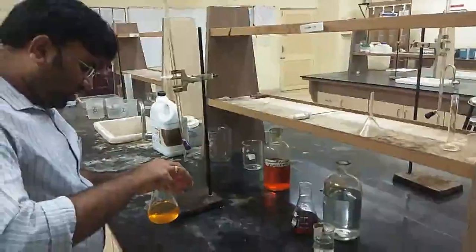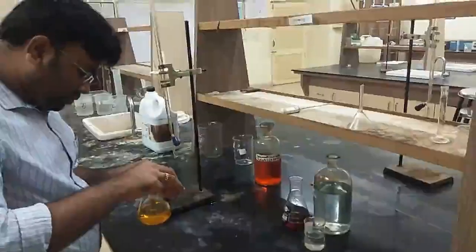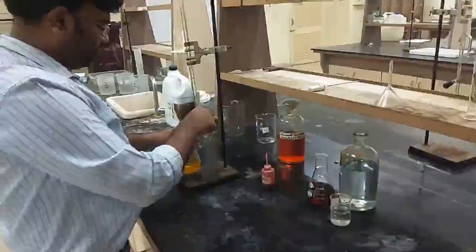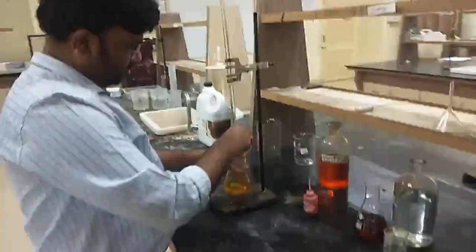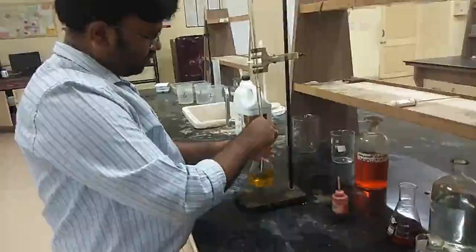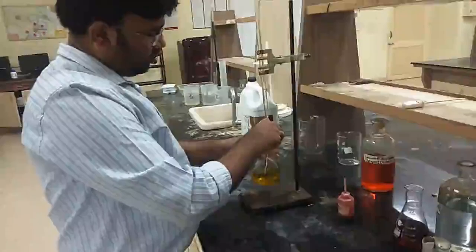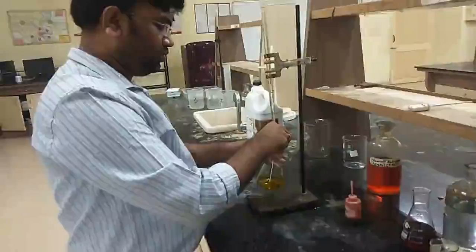We're going to add ferroin indicator. And let's do the titration. Right, so drop by drop addition is required for doing the titration process.